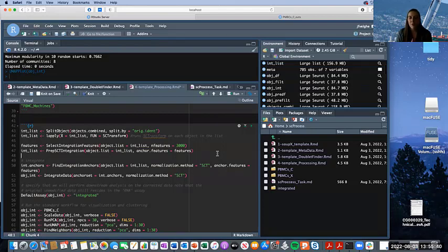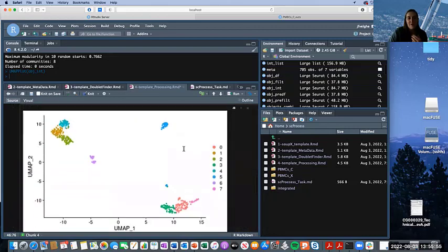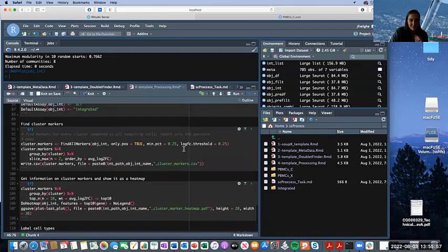And then if you do any differential gene expression on that, it's only going to be looking at those features in the integrated assay that you indicate there. You can always increase it. It'll just take longer for this function to run and might take more time.